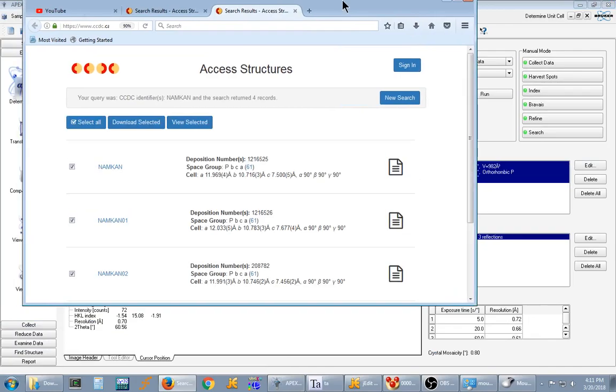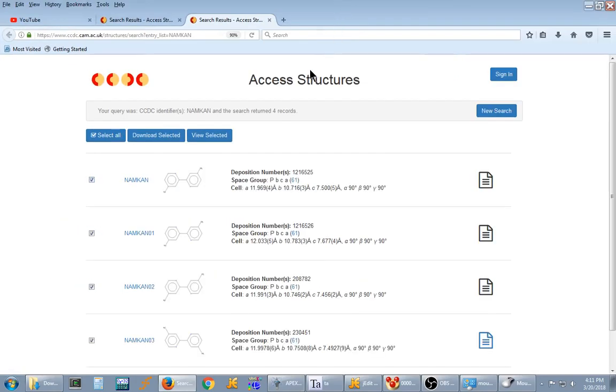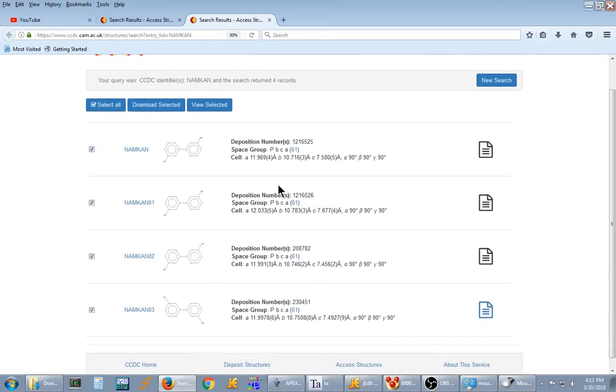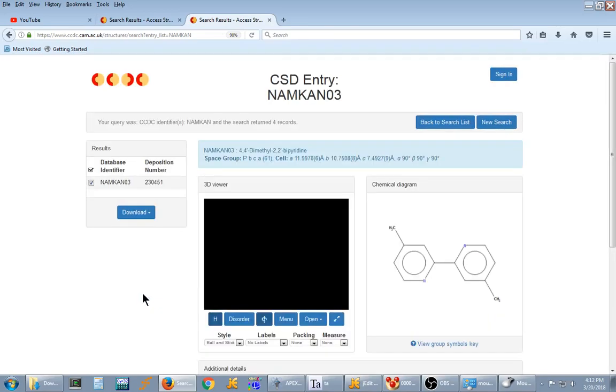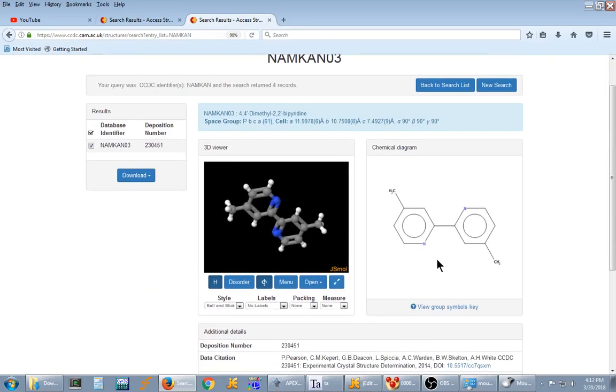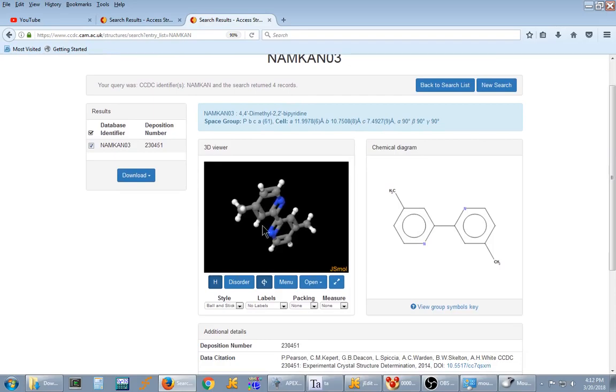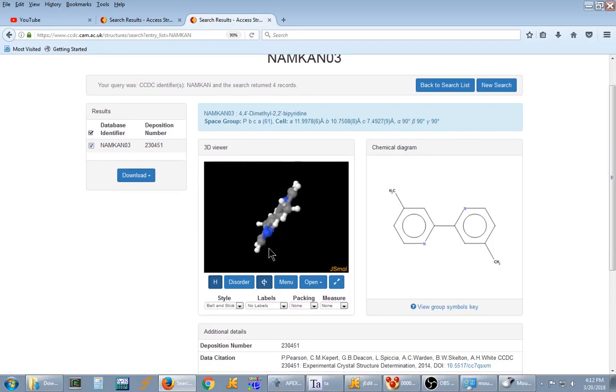It pops up a browser window and gives you a list of structures. Now the reason it gave me a list and not taking me directly to the page is there's multiple versions. We'll just click the most recent one and there you get a diagram and a 3D model of the ligand I ran by accident.